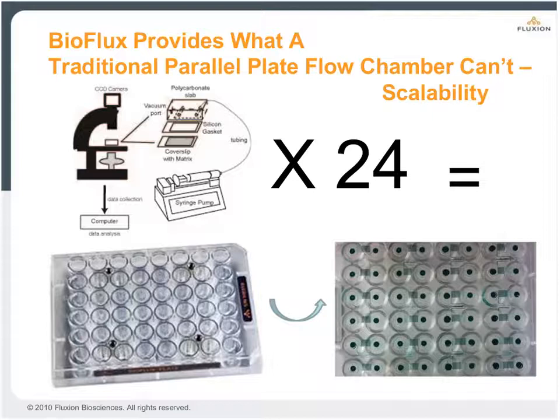Each channel of the well plate microfluidic is, for all intents and purposes, a flow cell, but it doesn't have the baggage that's associated with a normal flow cell or the fluid volumes associated. The BioFlux plate serves as a self-contained array of flow cells.